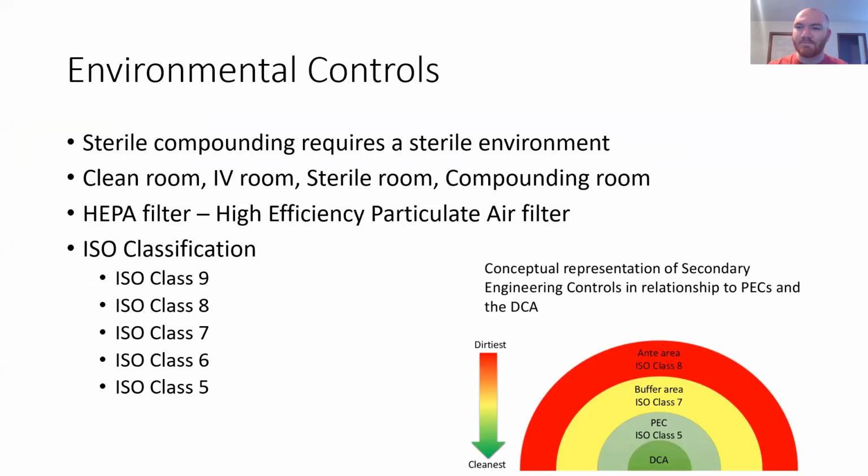So the main parts or pieces of sterile compounding are the IV room, clean room, or whatever you want to call it. There's different names. So that's the whole shebang. A lot of people just call it all the same thing. Really, there's an ante room, a buffer room, and then your primary engineering control, which is like your hood.